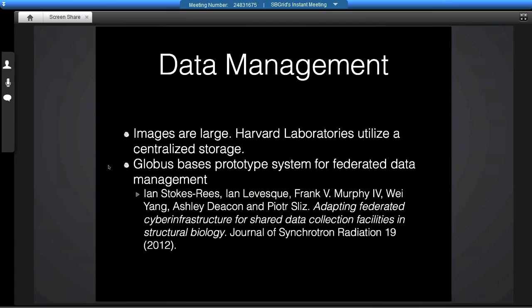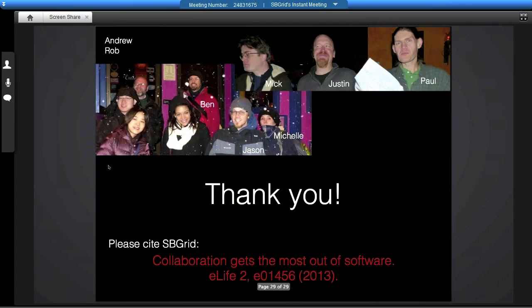Say that the time lag between collecting data and publishing the structure or depositing it in the PDB may be a critical factor in saving the images, because it may be that people don't have the data properly archived at home over the period of a couple of years before they deposit the structure. Right, but if you're publishing a structure and you don't know what your data set is, I think you're in trouble. I don't think you should publish if you cannot back it up with the experimental data, right?